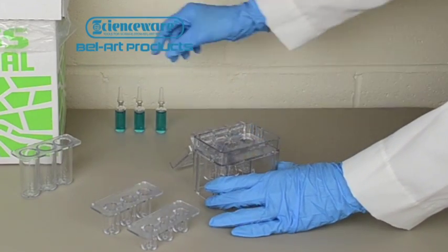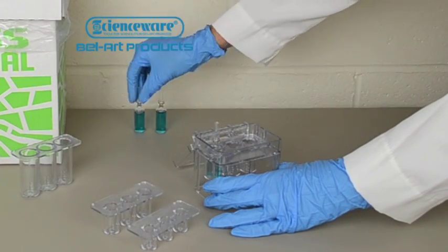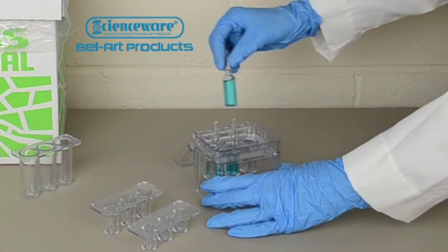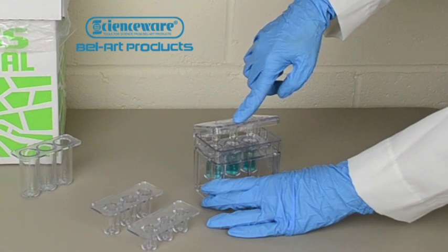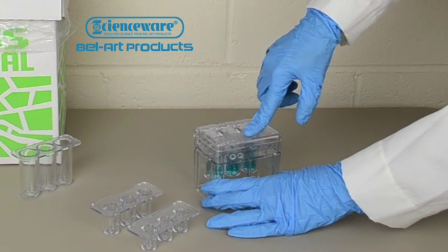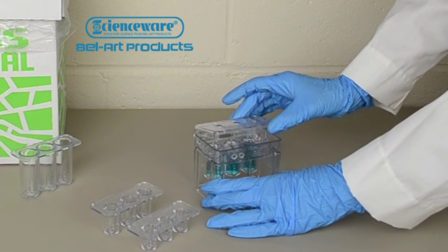Put one, two, or three ampules into the insert and lower the lid over the ampule tops. Push down gently with one hand on the science wear logo until the ampule necks break.